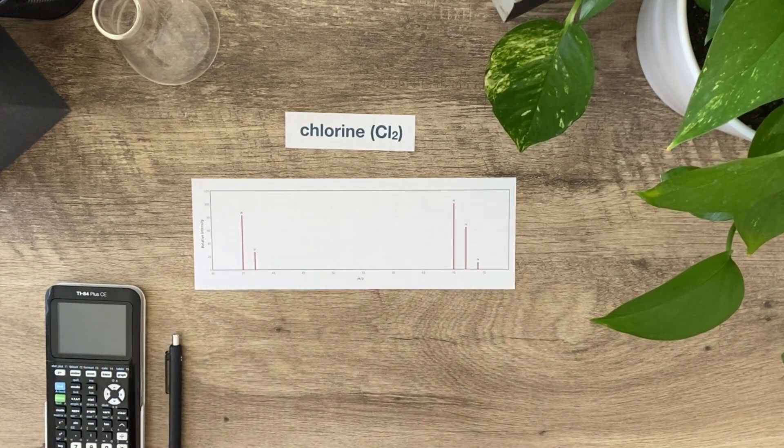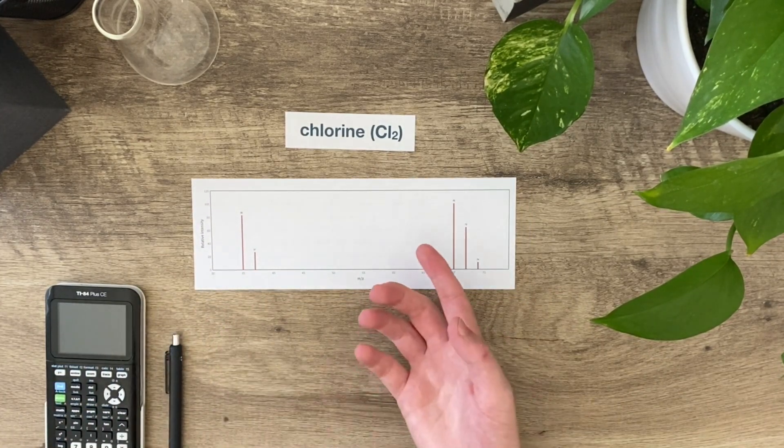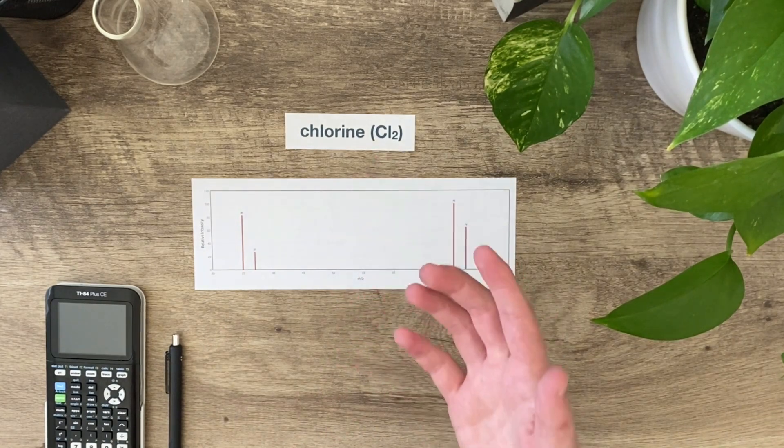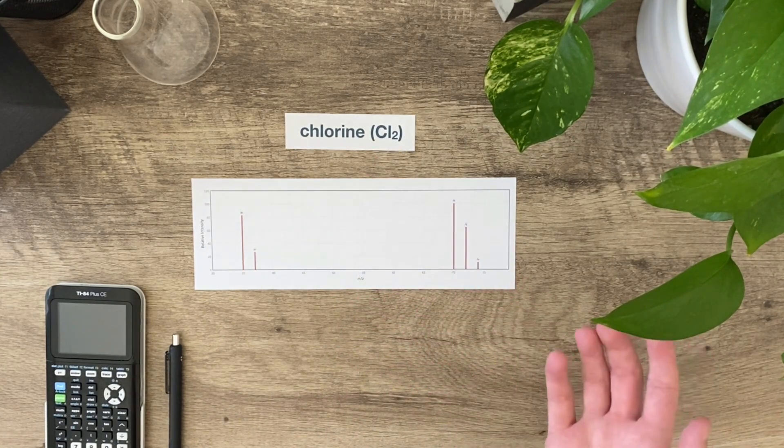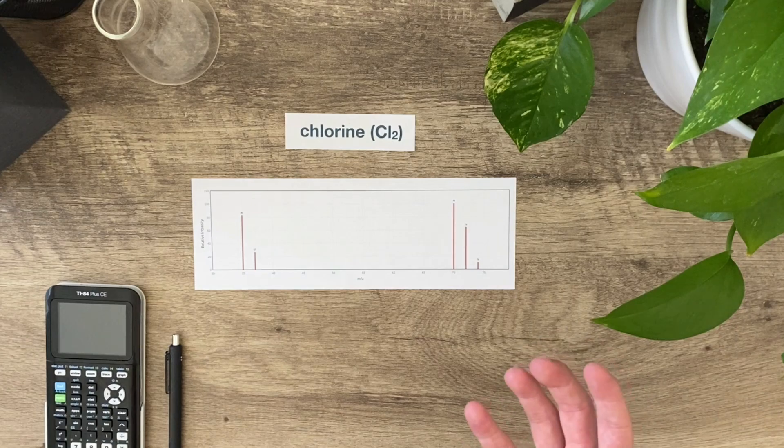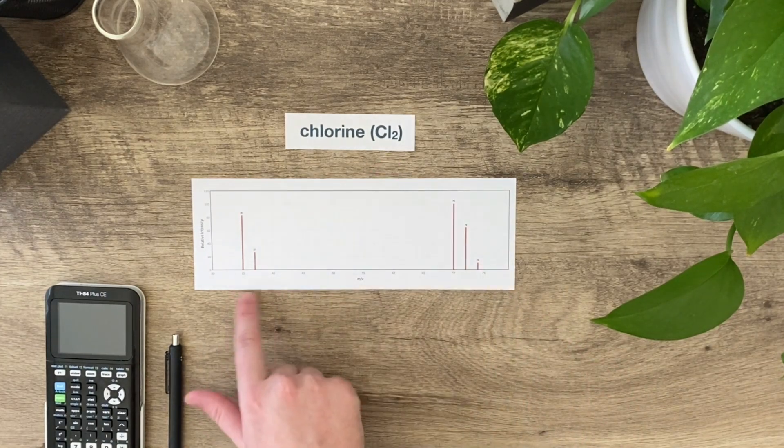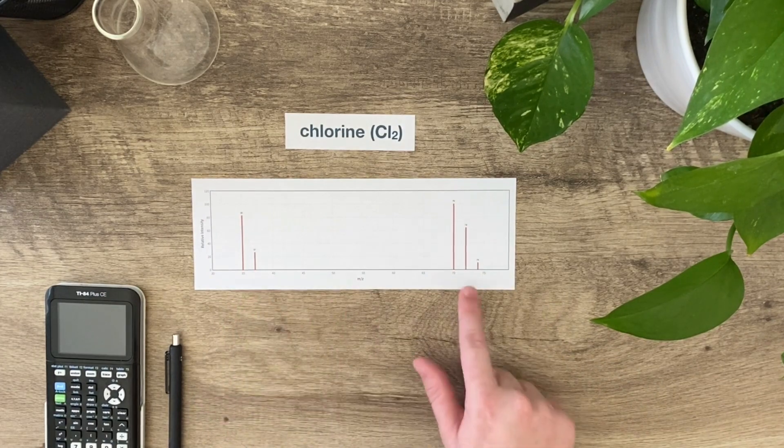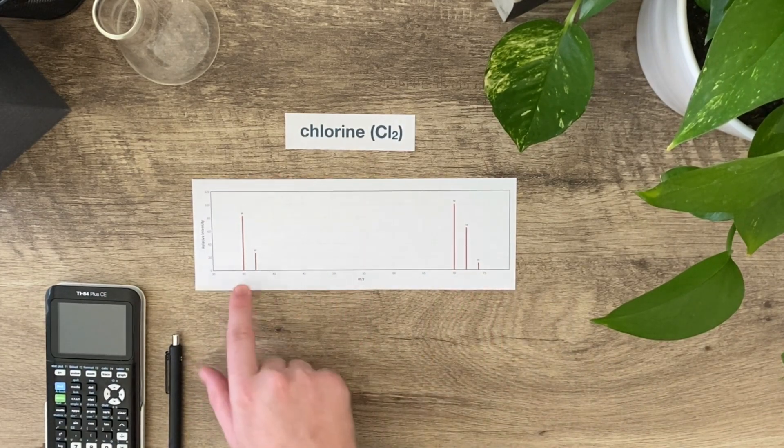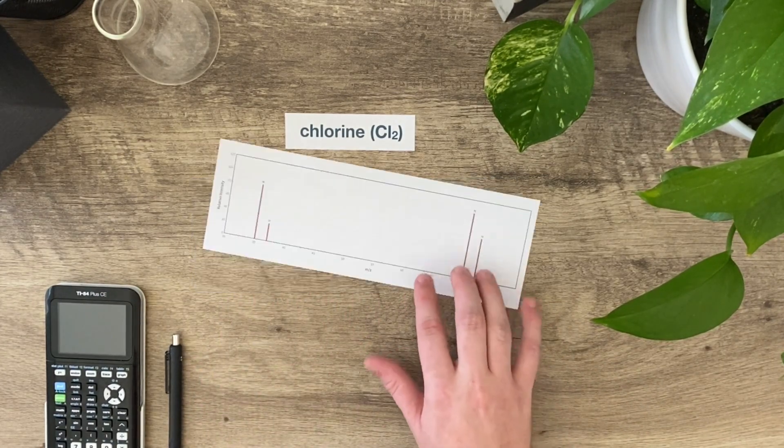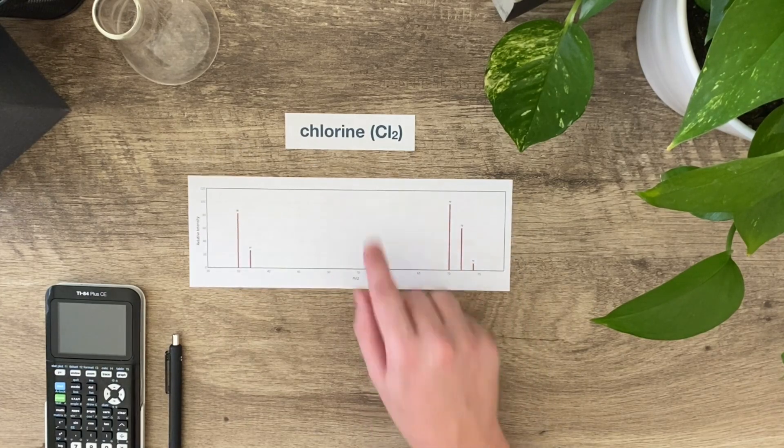This also tells you a lot more. You might ask, well okay, if the average atomic mass of chlorine is 35.5, why are there two peaks here and why are there three peaks here? Why isn't there just one peak and one peak? The reason is because of isotopes.